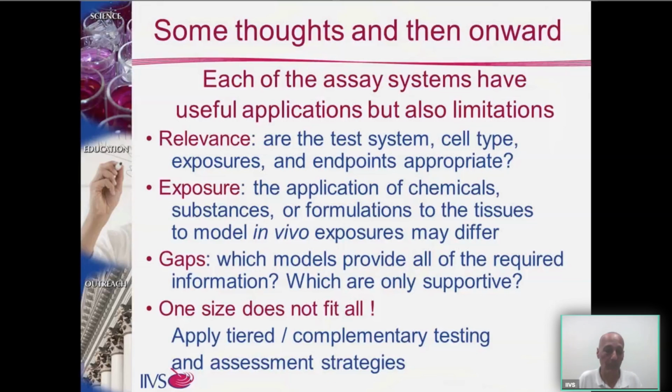Certainly, this then concludes to the fact that one size assay does not fit all. We need to apply a tiered approach, complementary testing approaches, and assessment strategies so that we can address each of these issues of relevance and gaps in and limitations of each of the test methods so that we can build a better picture for the in vitro test outcome.